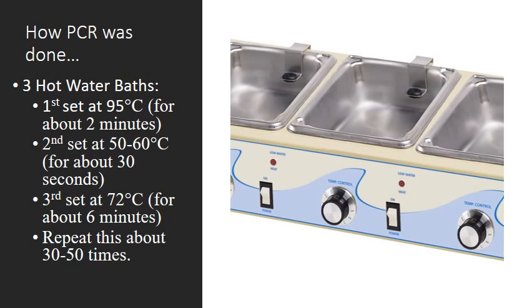And oh my gosh. All right, so you would have to stand there by this hot water bath, and you'd have to have someone with a timer, and they would set the timer for 2 minutes for the first hot water bath. And once the timer goes off, you switch from the first hot water bath to the second. And it has to be quick, right? So you're just like boom, boom. You can't sit there and wait for it. You've got to be right there on time whenever it goes off.